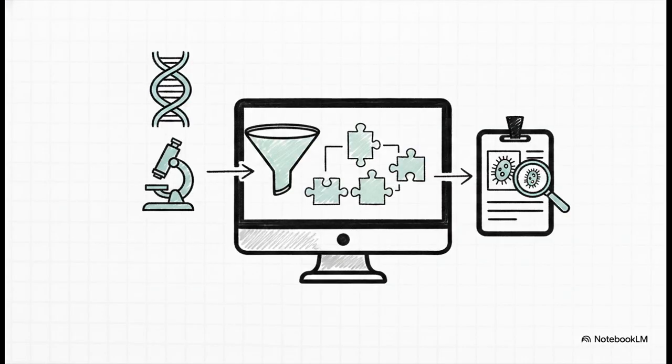So, the million-dollar question: how do we synthesize all this evidence? We take all those compiled morphological, metabolic, and genetic clues, and we feed them straight into automated software programs and diagnostic flowcharts. This computerized data matching crunches all the variables and finally slaps a precise scientific identity onto the pathogen. Boom, we've officially solved the clinical detective story.